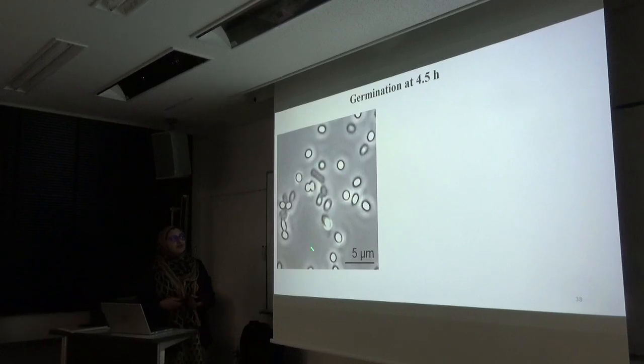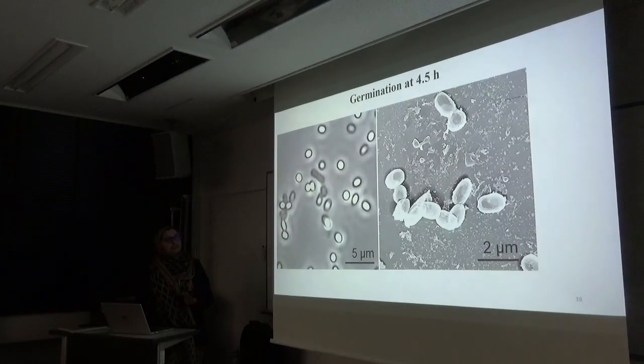First I confirm the condition of the sample, because germination is a process in which the spores don't germinate at the same time. So this condition was the best condition where I can see all the stages at the same time. So I chose this condition, and I could see many interesting images.